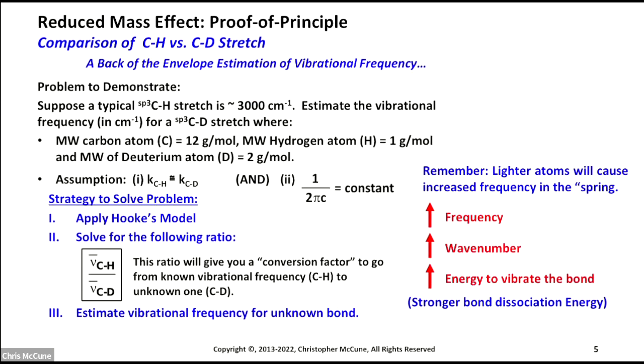But what we'll also notice is that by just changing the mass of the hydrogen from 1 to 2 using deuterium, there's a huge effect here. And that's because the light atom really dominates what's going on. So we're going to change the hydrogen and make it just 1 mass unit higher, and we'll keep the carbon mass constant. That's why we're using carbon in each case.